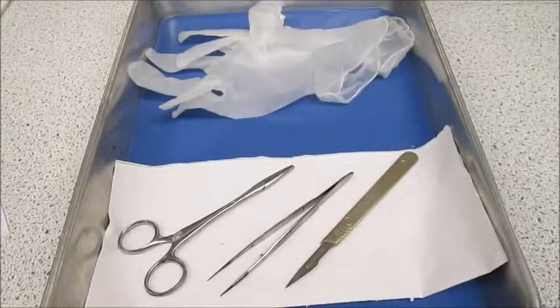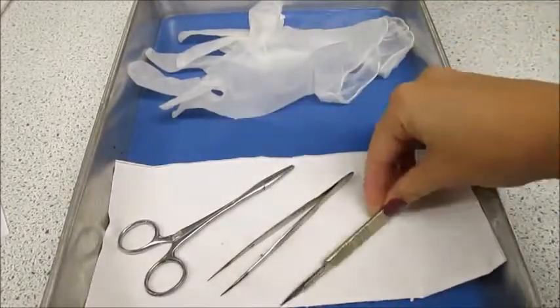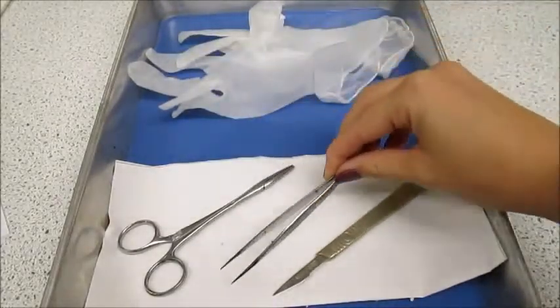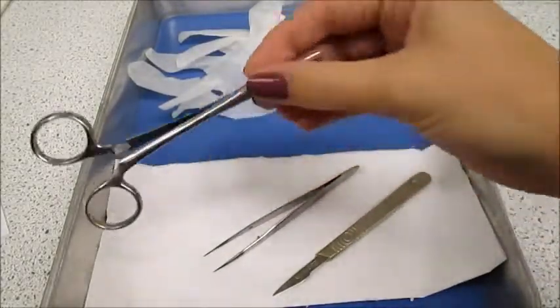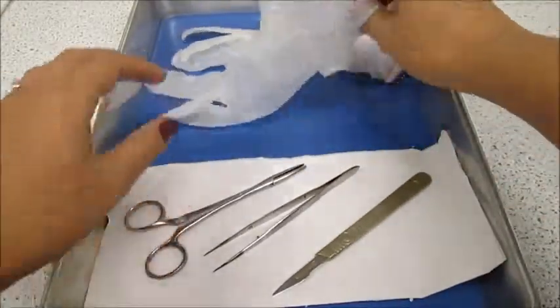The equipment you will need to carry out this experiment are a dissecting tray to keep all the parts together, a sharp scalpel to cut through the eye tissue, a pair of sharp tweezers, paper towels to clean up any mess, and finally a pair of latex gloves to stop your hands from getting messy.